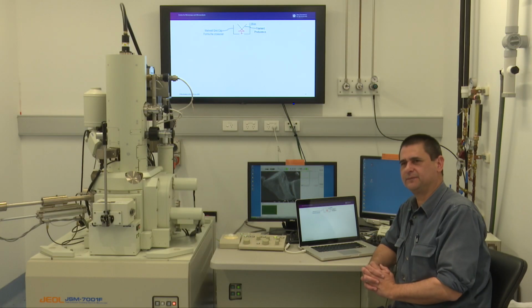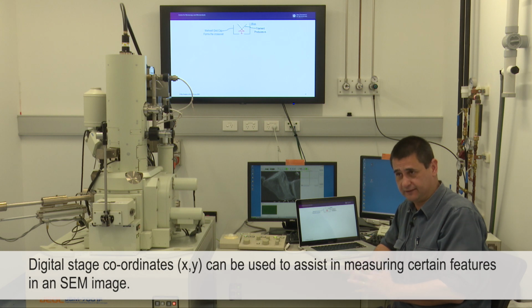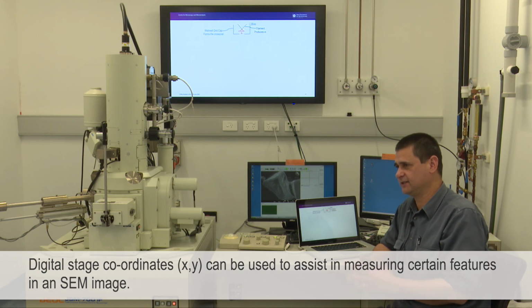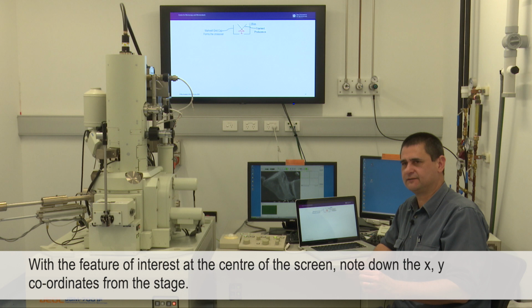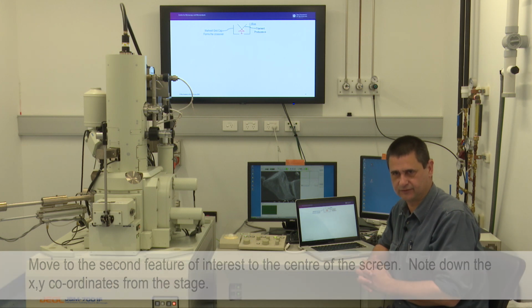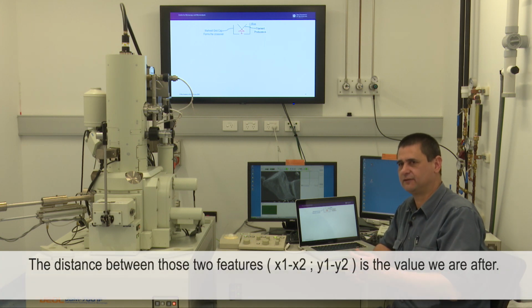Most digital microscopes have a stage coordinate X, Y, Z. If you happen to be trying to measure large distances, rather than trust a very low magnification image, move one feature to the centre of screen, note down its X, Y coordinate from the digital stage, then move another feature to the centre of screen, note down its XY coordinate from the digital stage, and then the distance between those two features is x1 minus x2, y1 minus y2. You can do simple mathematics with the digital stage. I do that quite a lot.